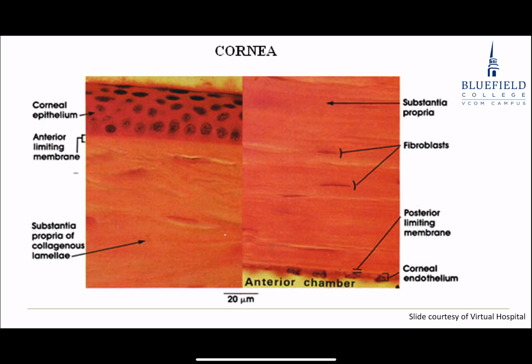A lot of times you do see debris, realize the tears and the secretion of those glands is kind of oily, particularly the secretion of the glands, and so, yes, you get a little bit of that effect sometimes on the surface there when you see the slides. It doesn't always look nice and smooth, and those are just simply if you're making a slide, the oil kind of beads up.